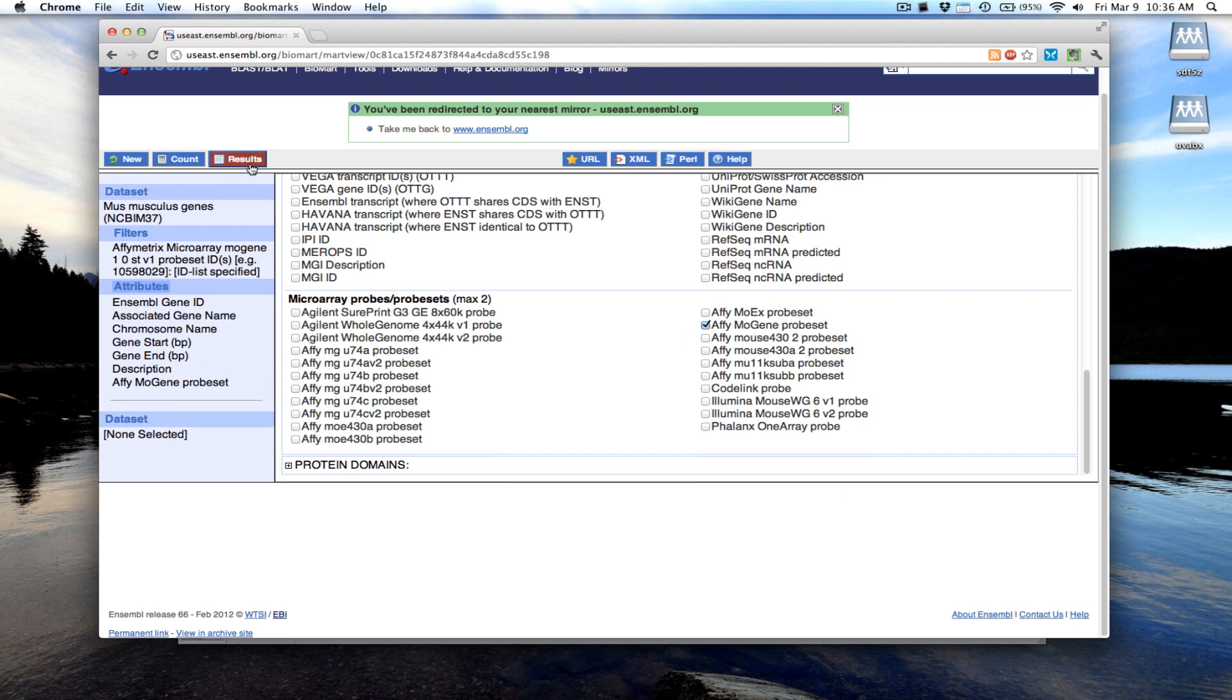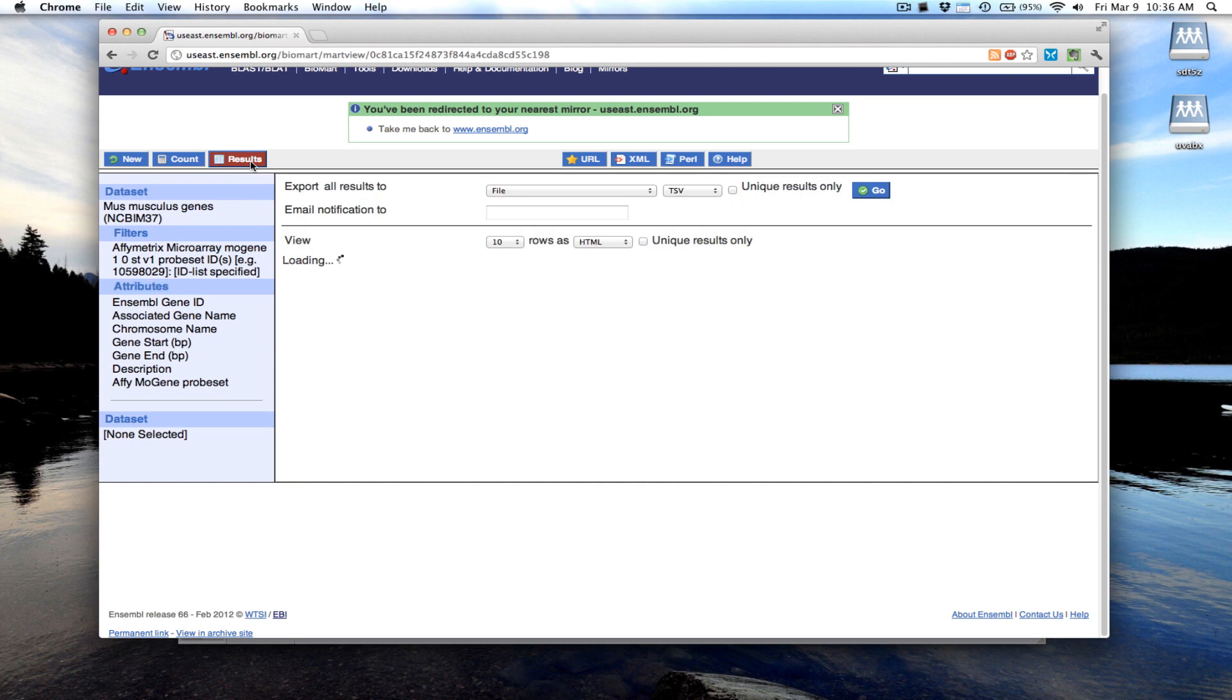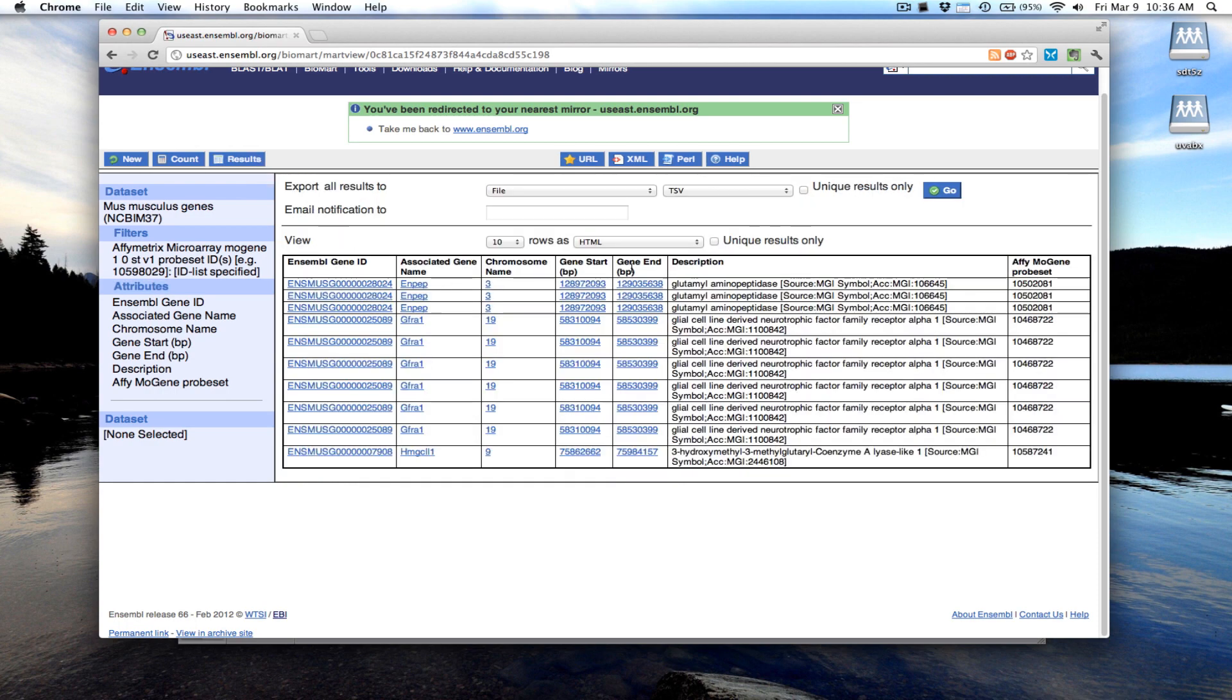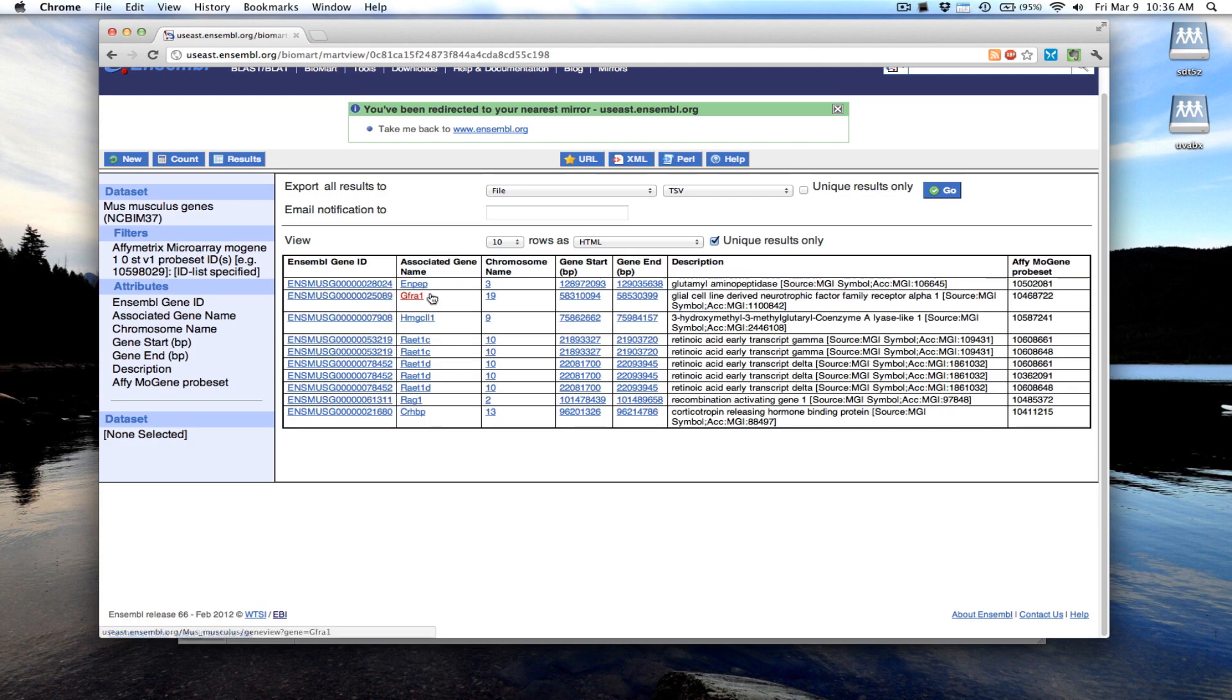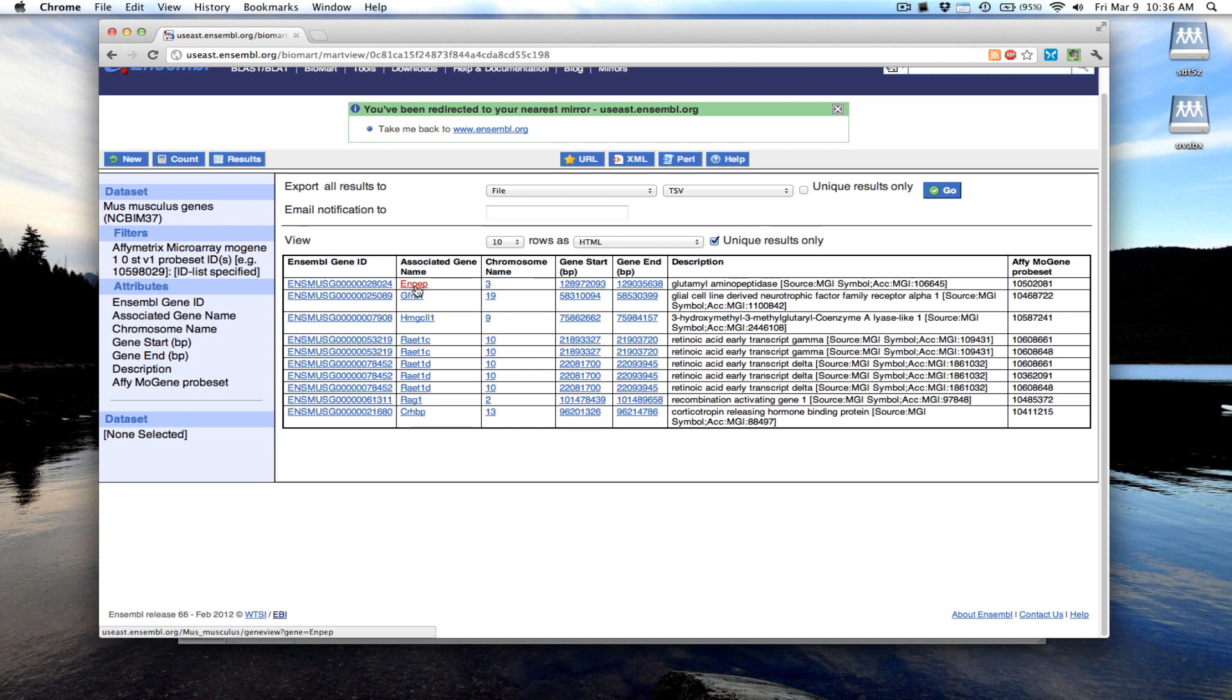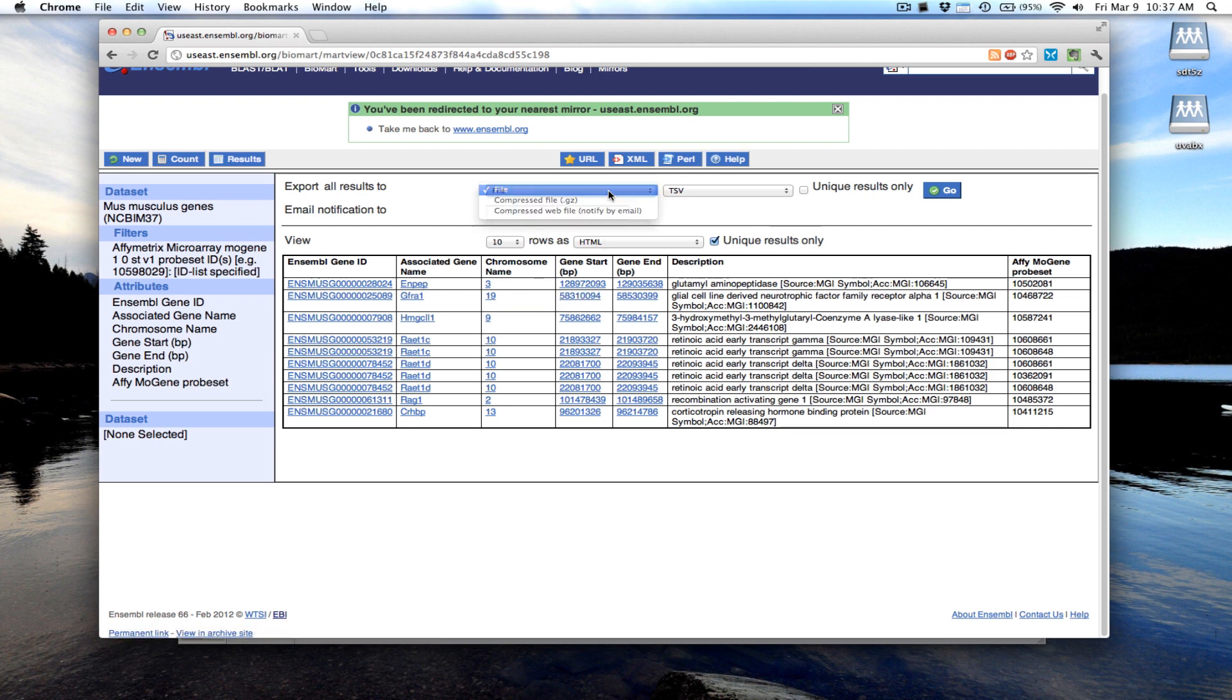Once you've selected which attributes you want to display, hit Results. Then click Unique Results Only. This shows you that, for instance, probe set 10502081 maps to the gene ENPP and so on. You can export these results to a file.